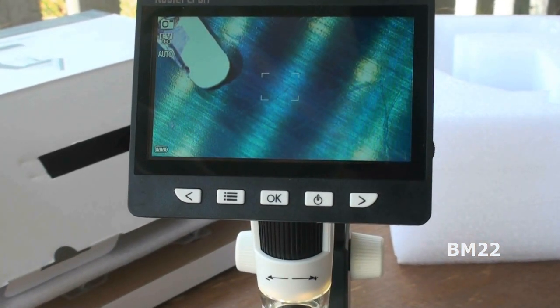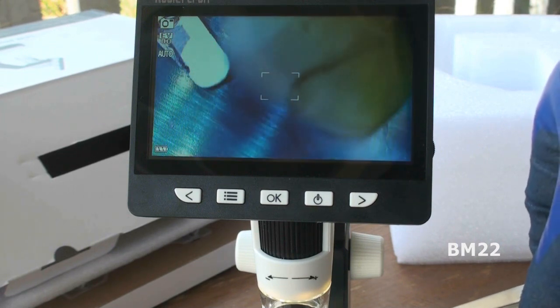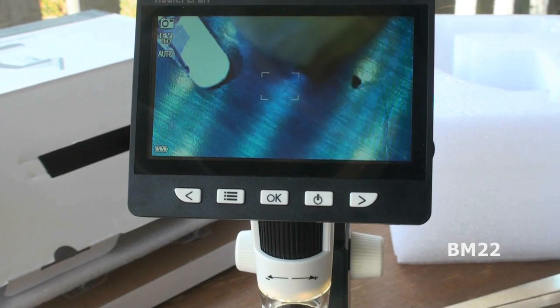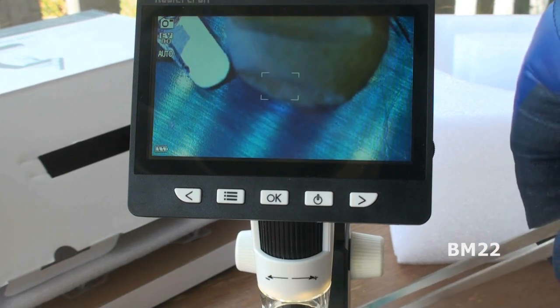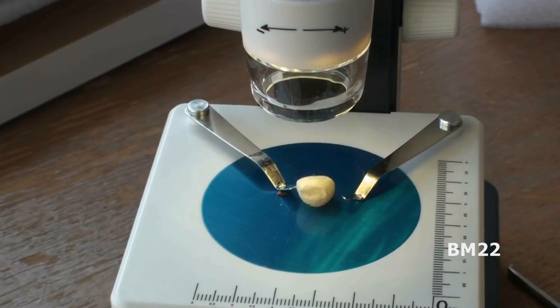And just for this very purpose, I had ordered a Coolertron digital video microscope from Amazon. It was around $100. I think I paid $97.14 or something, almost $100 and we should be able to get some cool video.